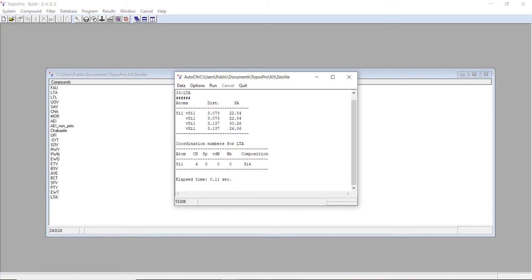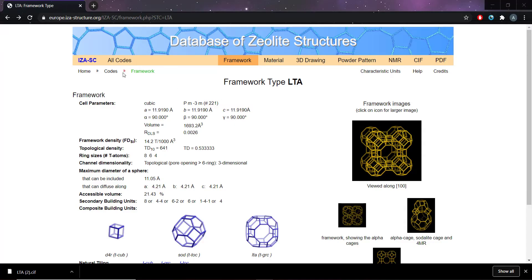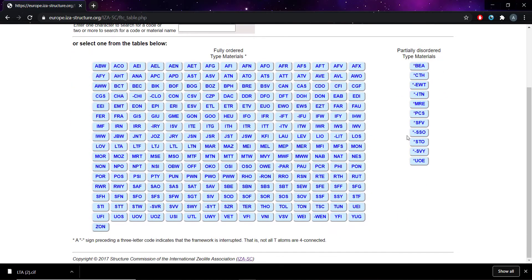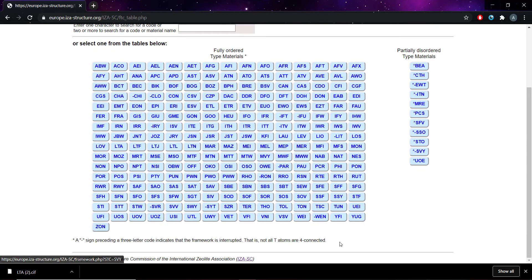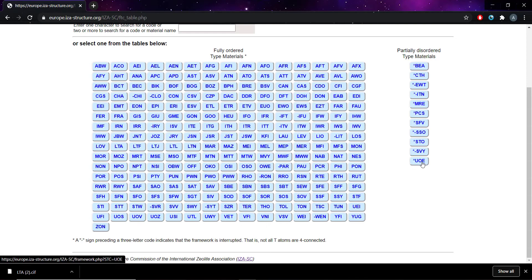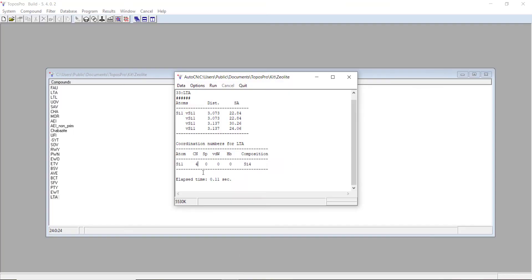Those are represented by dashes if you go back onto the IZA. These dashes show you that it's an interrupted framework, so these might have coordinations of 3 or 2. The stars represent a disordered framework. That's not too much of an issue, but definitely look out for the dashes. That's a good way to tell if you've actually calculated this correctly.